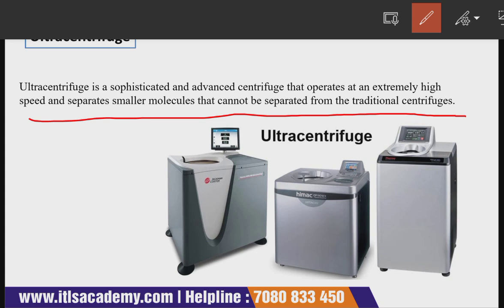If you look at the image of this centrifuge, you can understand that it looks somewhat like this. It resembles a very high technique, and if we talk about its speed, it operates at a very high speed, up to 1,50,000 rotations per minute. So you can understand up to which height it is operating.